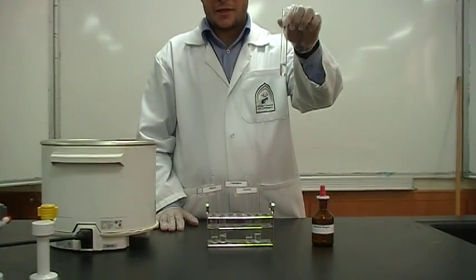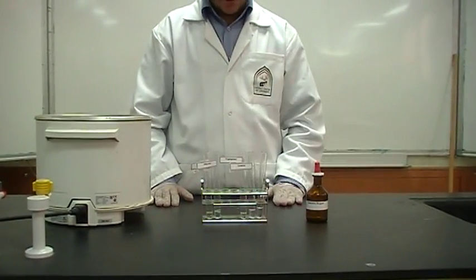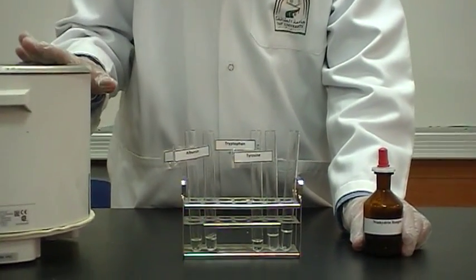And here's a control which is carbohydrate — it doesn't have any label. What do we need for this experiment? We need a ninhydrin reagent and a water bath.